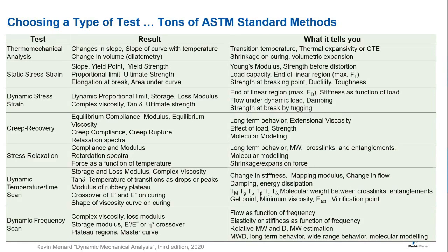You can start from the last column. What it tells you, you can start from this column and find the goals of your tests. This table and some other material are taken from Kevin Menard's book, Dynamic Mechanical Analysis, 3rd edition. This is a great book, a great resource for DMA analysis. This table also summarizes today's topic.